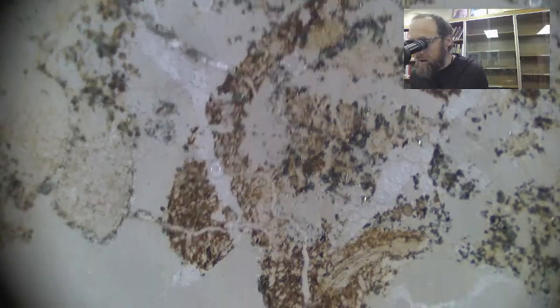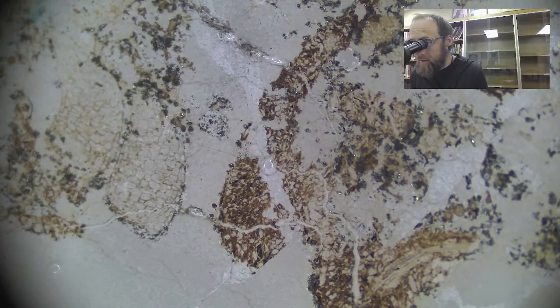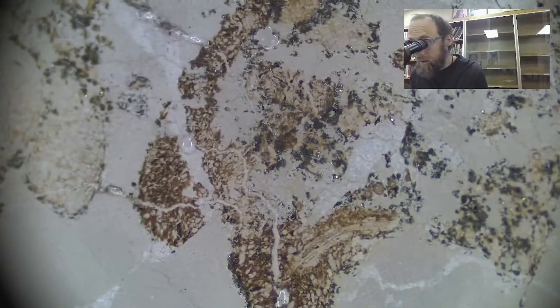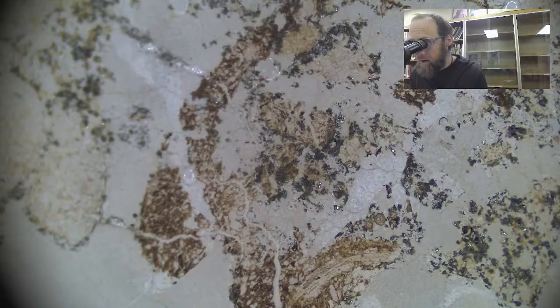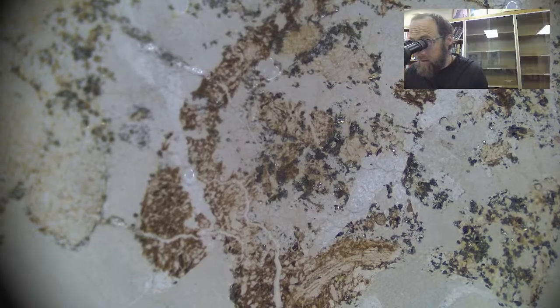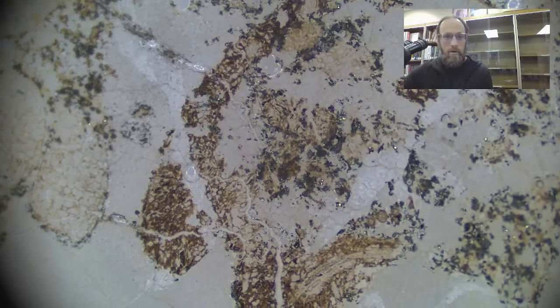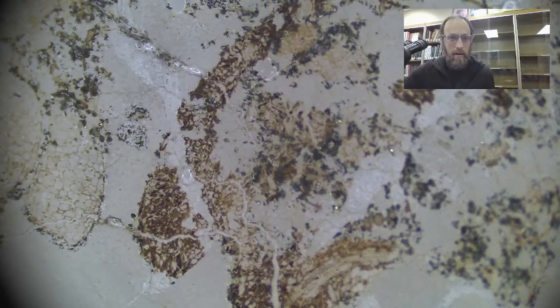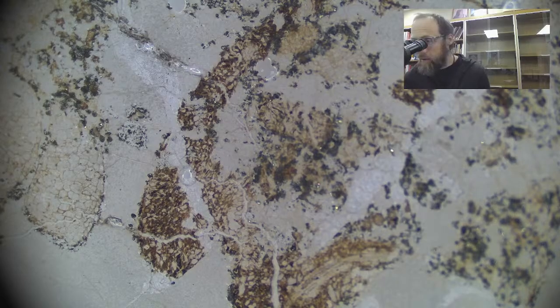I think one thing I need to do is train myself to look for bigger objects, because I don't think I'm looking for anything entirely microscopic. But I am looking to really home in on what you would consider a coprolite versus some piece of plant tissue that's been disembodied.